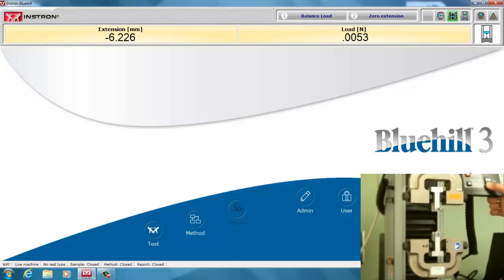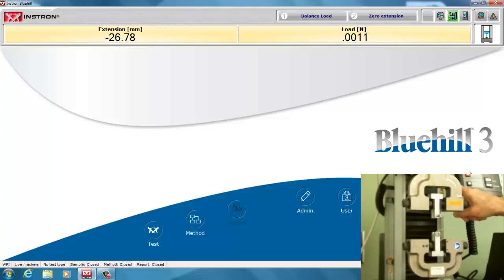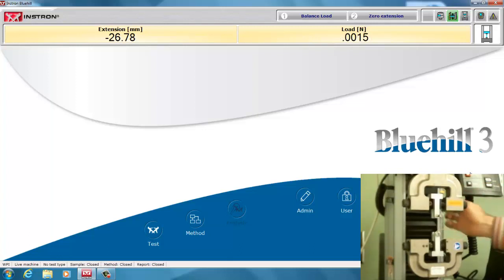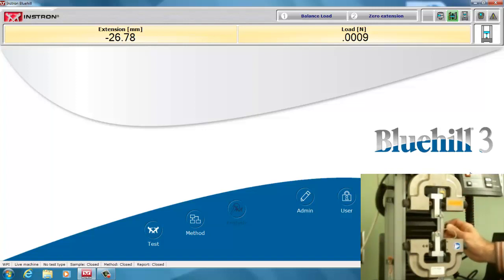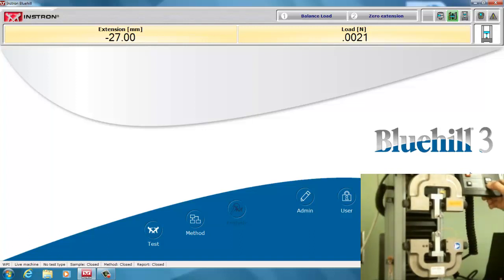Of course, the most important thing for the machine safety is setting the safety stop up here, which you can't see from the video too well, but here's the safety stop. We don't want to tighten that too tightly. We want to bring it down close enough for our grips.